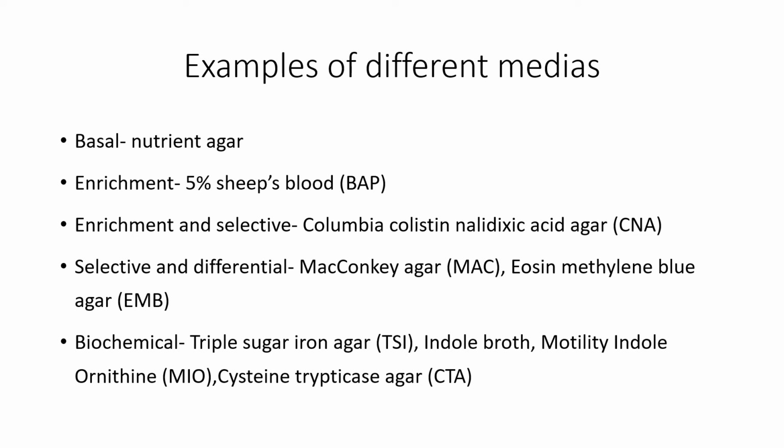You can actually add carbohydrates to that. It has a phenol red pH indicator, which denotes fermentation. Okay, many of these media are pretty cheap, like our basal and enrichment media are about 60 to 90 cents per plate, and then you get into those metabolic biochemical media, and they can run the gamut from $3 to about $10 a tube.